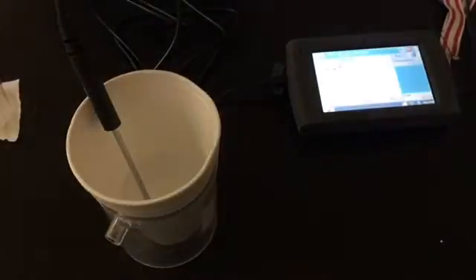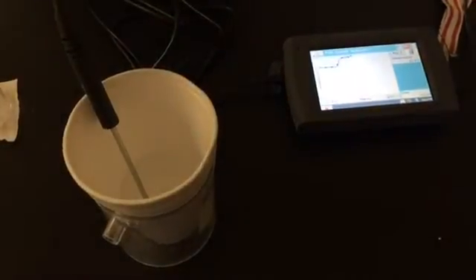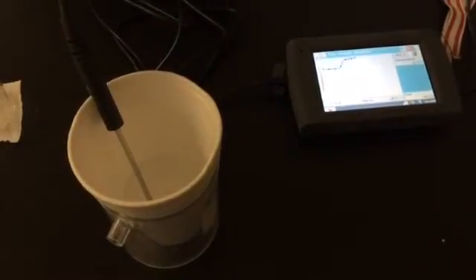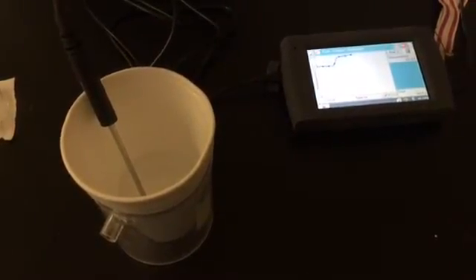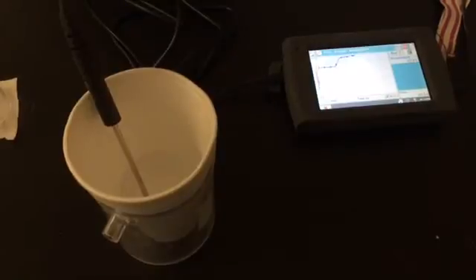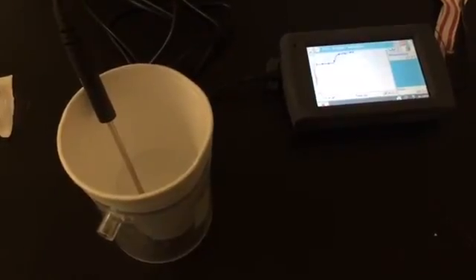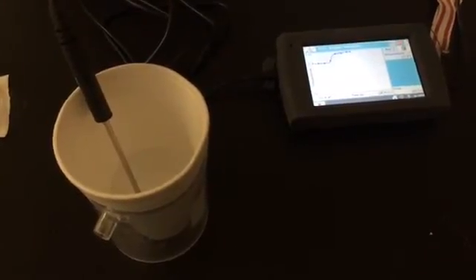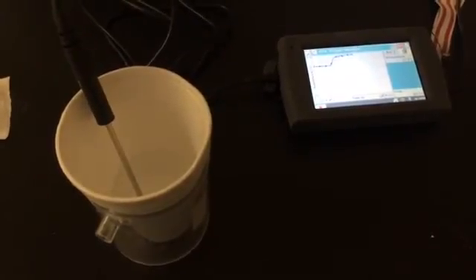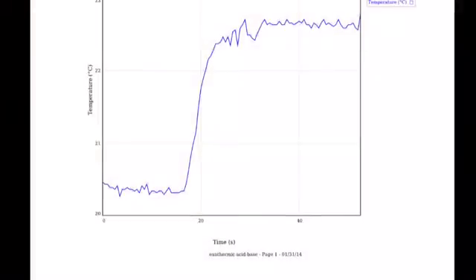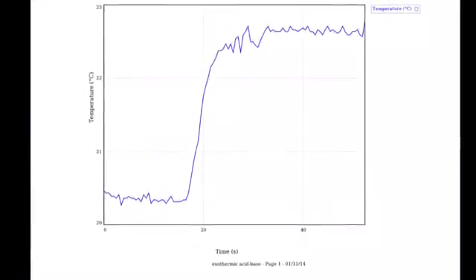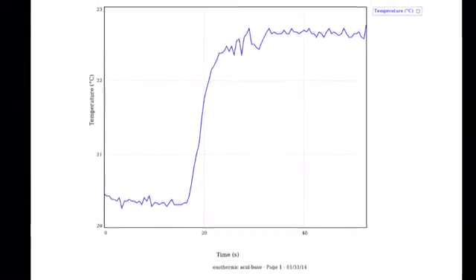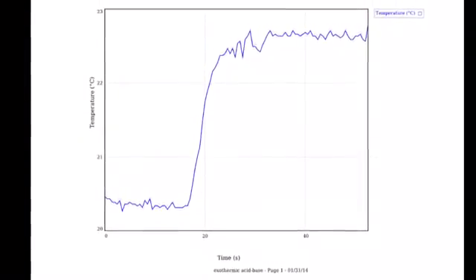This is the graph of our exothermic acid-base reaction.